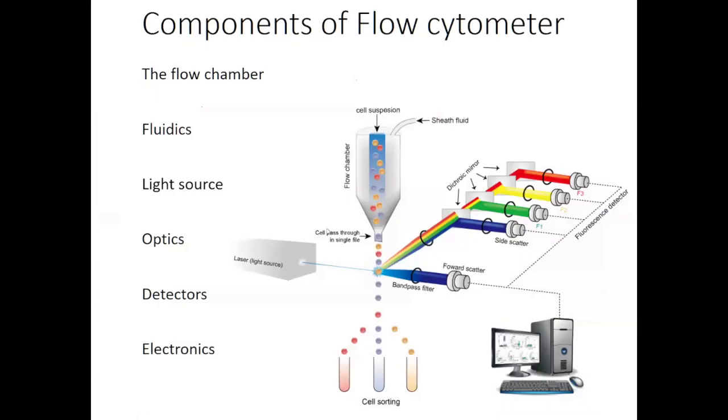Thank you. So now coming to the next part, a very, very important part, the light source. The first question I want to ask: which light source do you want to really use? Can you use the tube lights that we are using? Or can you use halogen lamps? Or can you use any other lamps? You want to specifically use lasers. Why laser? Anyone want to try?